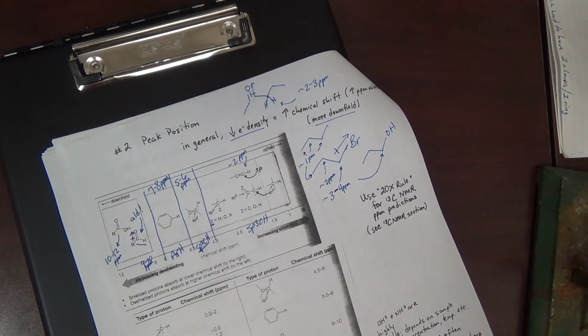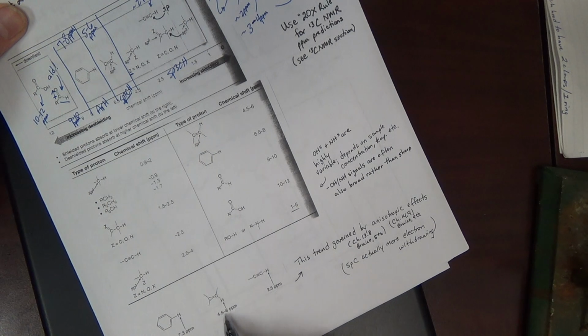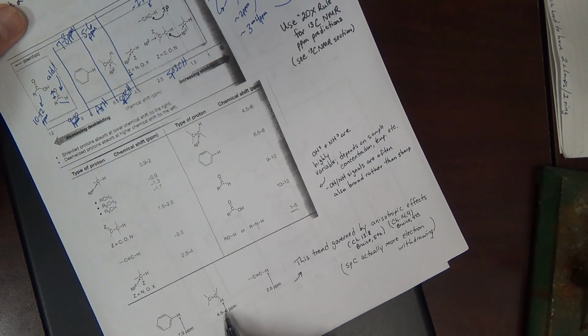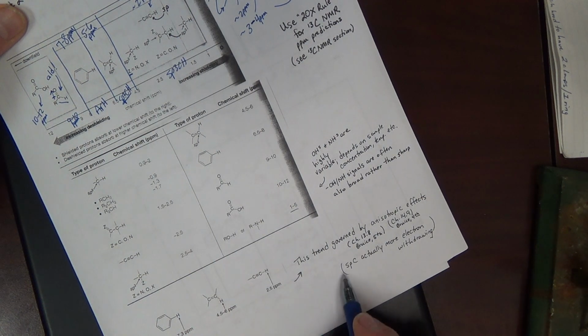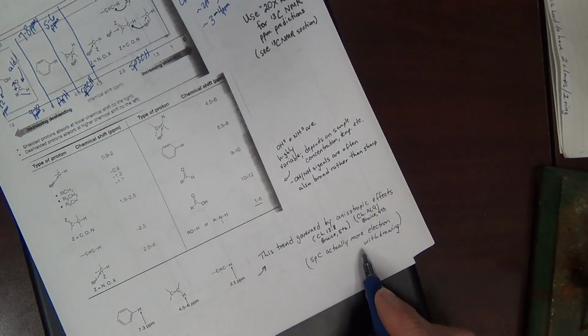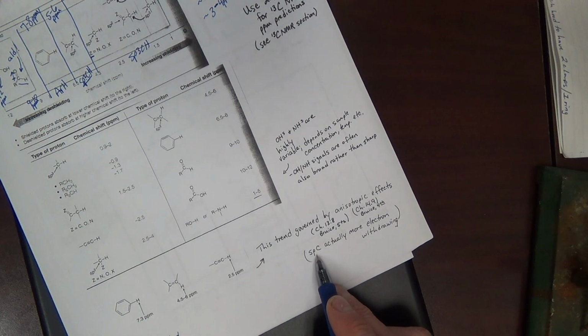It's an anisotropic effect. It's sort of shown down here. Aromatics about 7 to 8, alkenes about 5 to 6. This is sort of the other way. About 2.5 ppm. Now the sp carbon is actually more electron withdrawing because it's 50% s character.